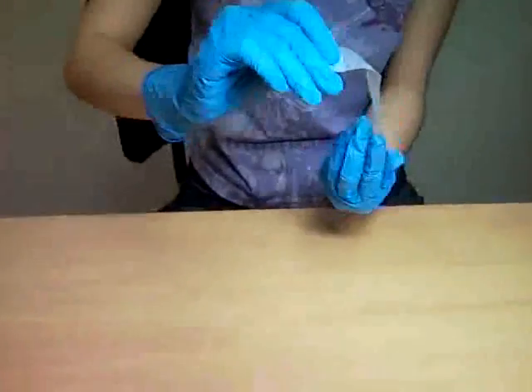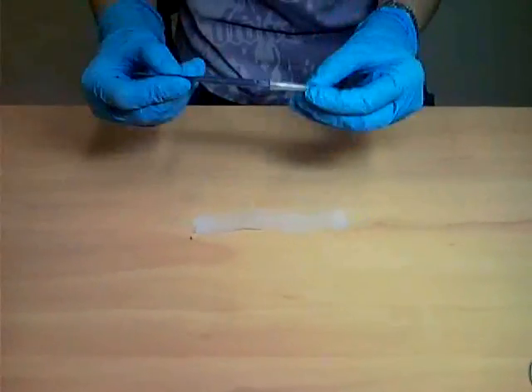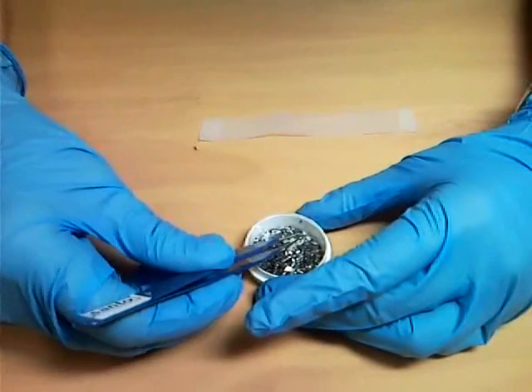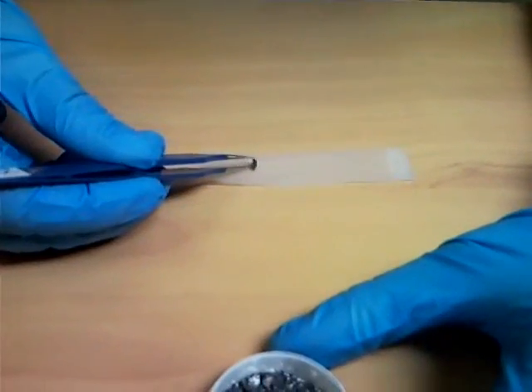Take a scotch tape and gently lay it down on a flat surface. Next, take clean metal tweezers and pick a thin graphite flake, and then place this gently onto the scotch tape.